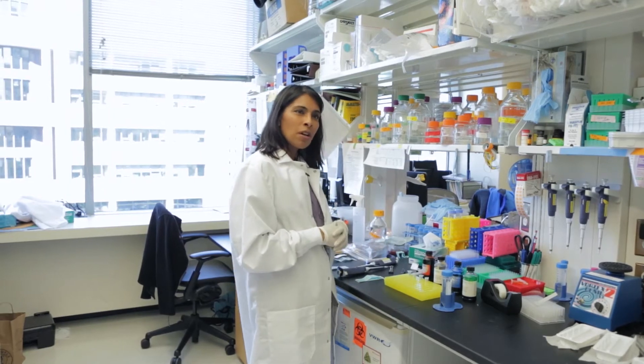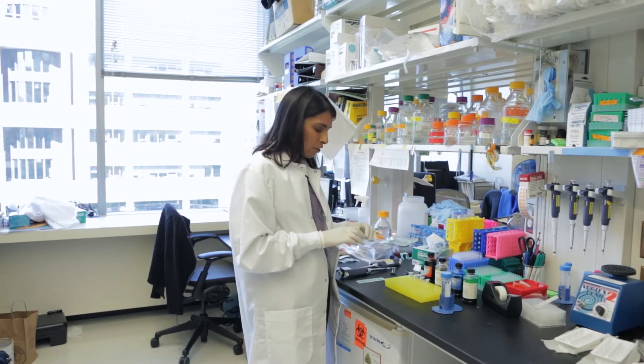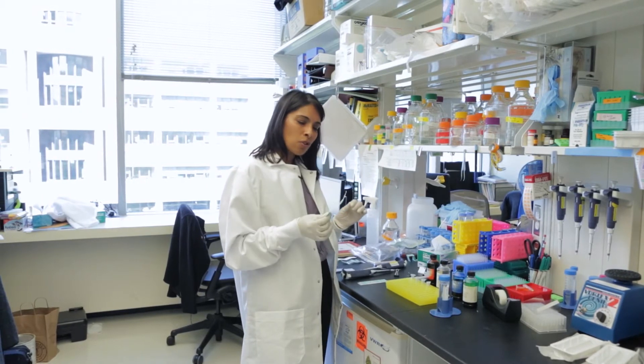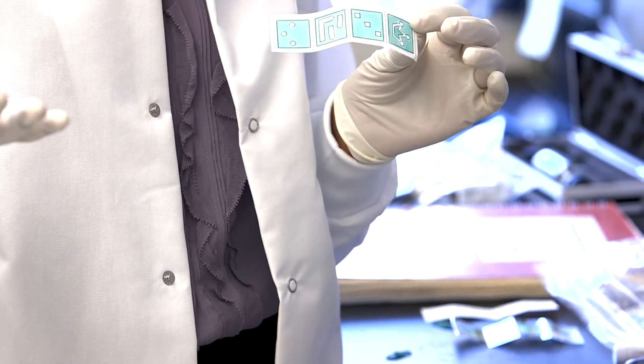I'm doing a demonstration for a project called Paper Microfluidics, which is an activity that could be done anywhere, and it demonstrates the concepts of capillary wicking for driving fluid flows through a porous media like paper.